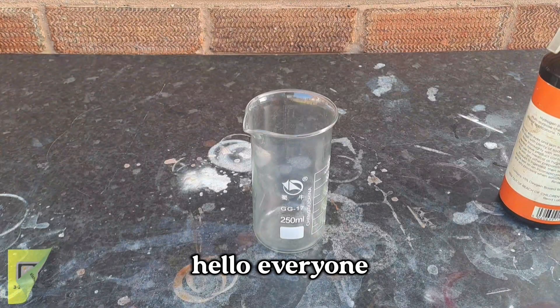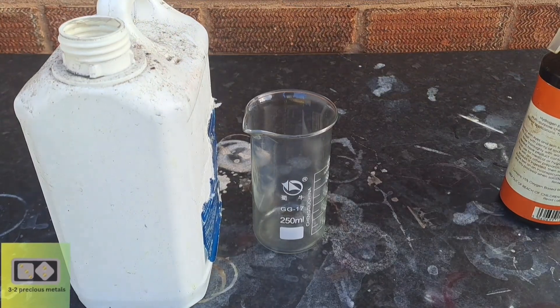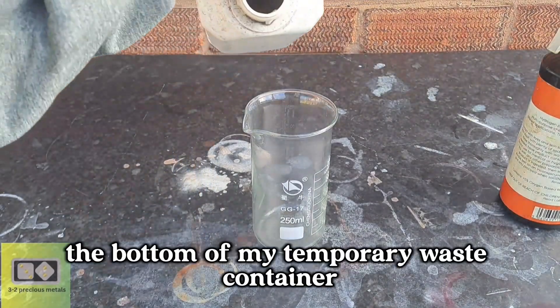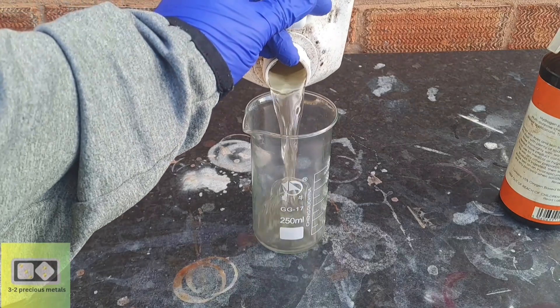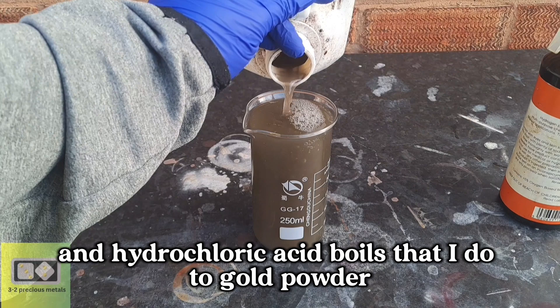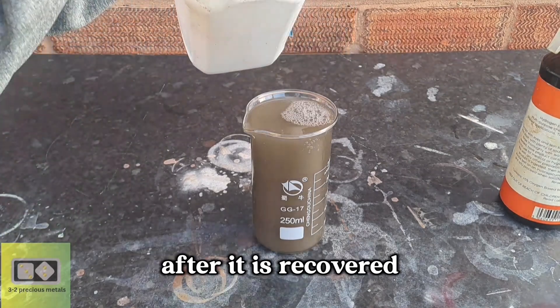Hello everyone and welcome to today's gold recovery video. In today's video, I will be recovering the gold from the bottom of my temporary waste container. This container holds the gold carried over from the washes and hydrochloric acid boils that I do to gold powder after it is recovered.